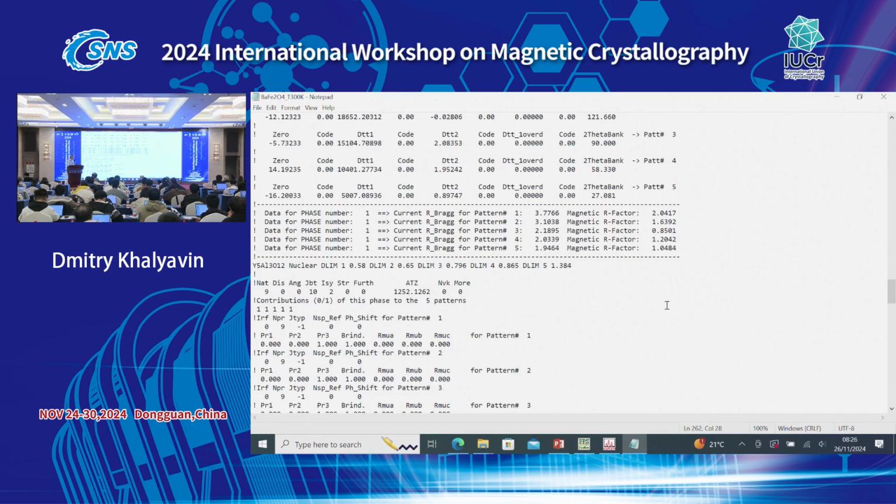That is what you can compare: the refinement you have done on your data, and someone else's refinement on their data with reported R-Bragg. This is the only meaningful factor you can cross-compare to decide which refinement is better. All the rest depends on the particular quality of the data. If models were tested on different data sets, on different patterns, there is no point in comparing chi-square. Okay?